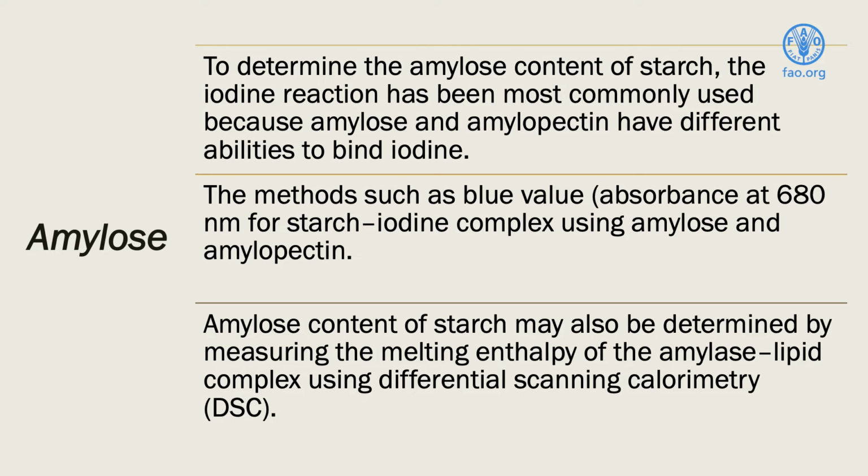Amylose content of starch may also be determined by measuring the melting enthalpy of the amylose-lipid complex using differential scanning calorimetry. But in my opinion, using iodine is better compared to this DSC.